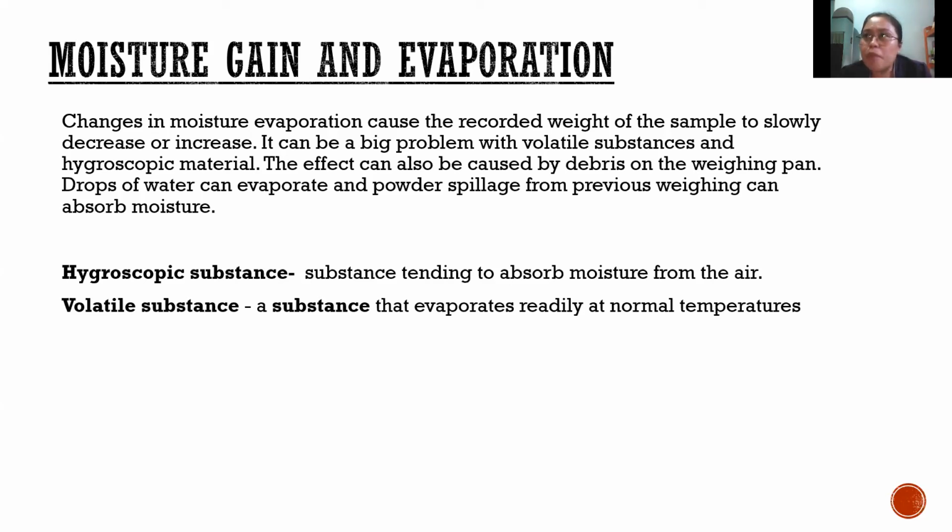When you place the sodium hydroxide nga mga solids or pellets in an open container, it will absorb moisture sa air, magbasa na siya, and kadugayan mahimo na gyud siyang liquid tungod sa pag-absorb. So during weighing, it can cause errors kasi naapil na nimo og ka-weigh ang water molecule nga iyahang na-absorb.